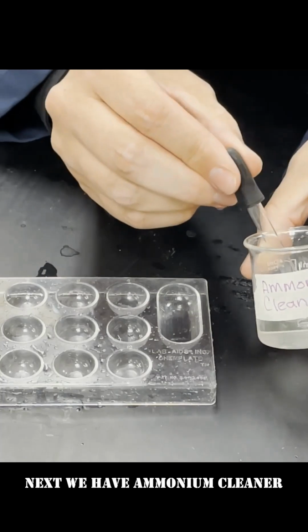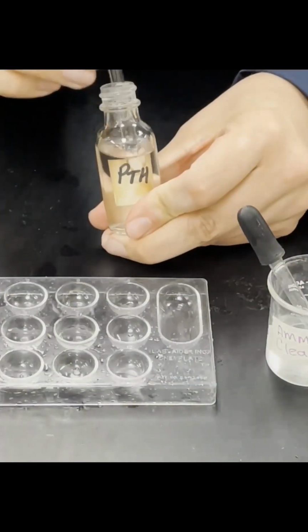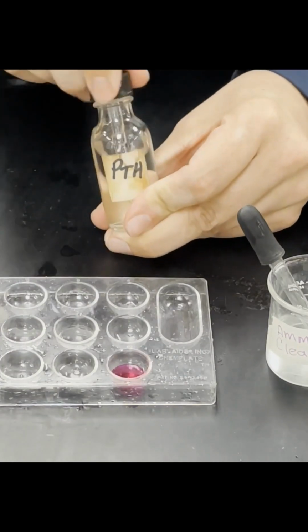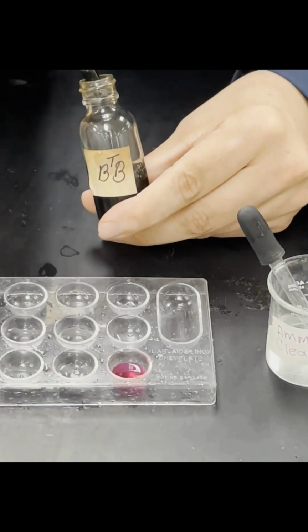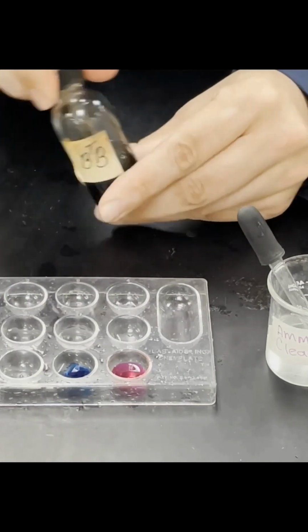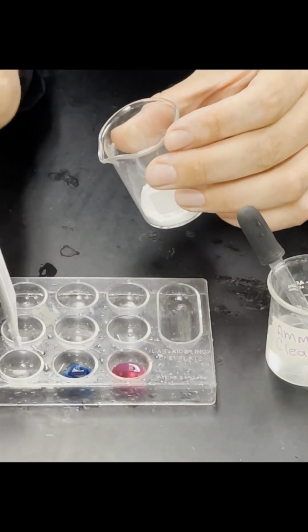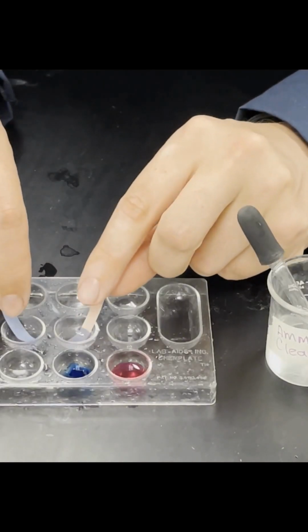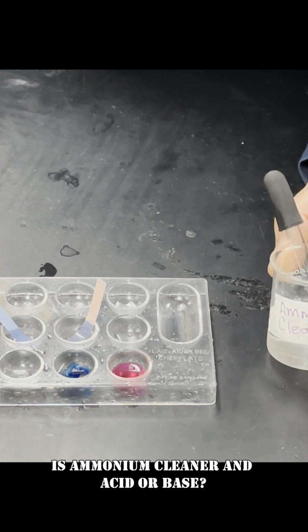Next we have ammonium cleaner. Phenolphthalein. Bromothymol blue. Carbonate. And litmus paper. So is ammonium cleaner an acid or a base?